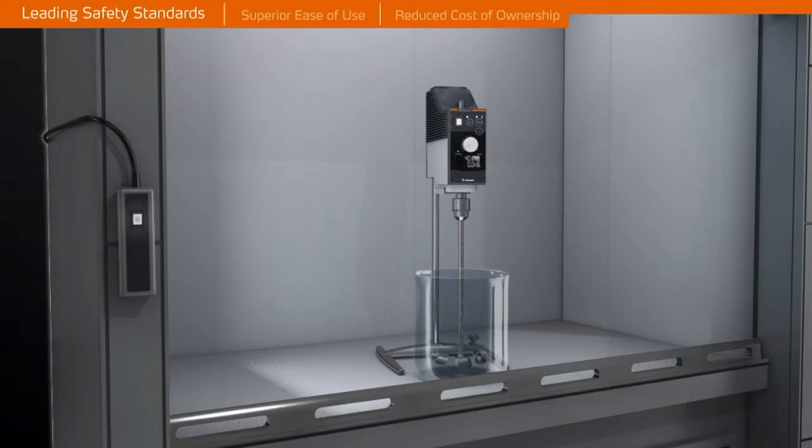An optional remote control allows for the highest operational safety from outside a closed fume hood.